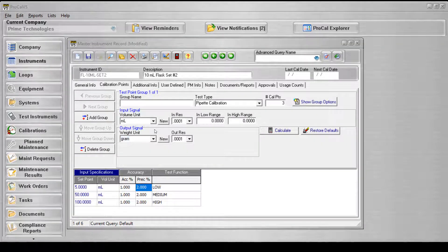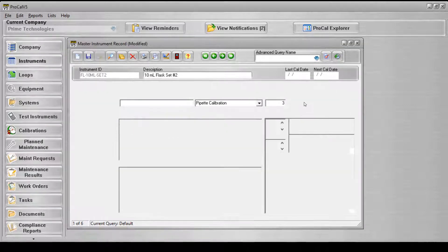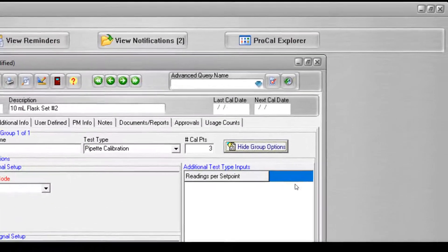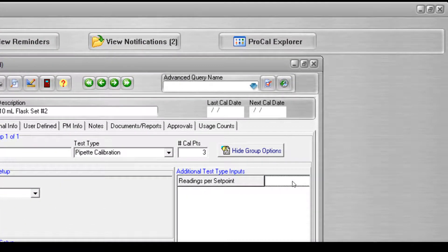Select the Show Group Options button to set the number of readings for each test point. The test type requires that there be at least two readings per volume for each test point in order to make the correct calculations. Let's set this to 3.